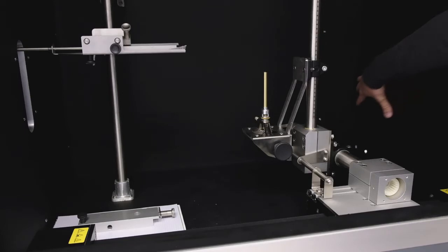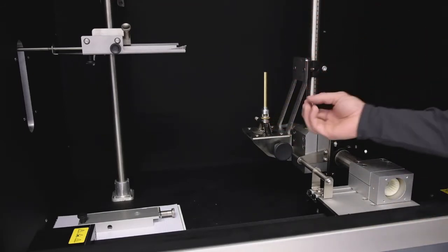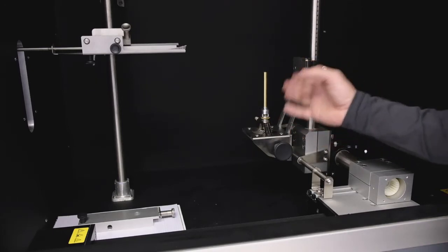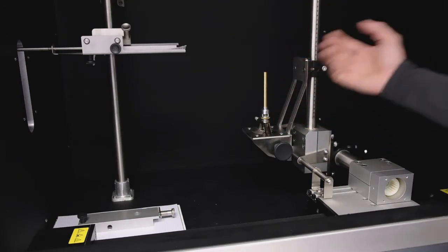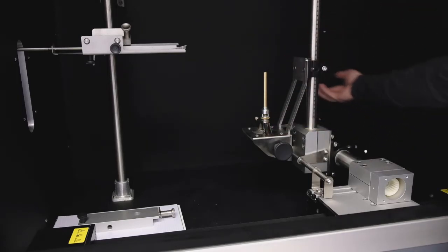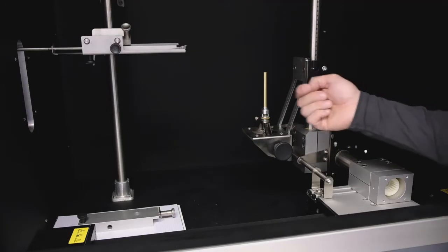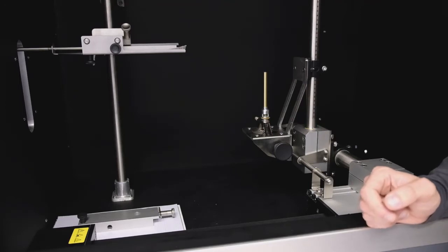Behind this wall we have all the electronics, all the connections to the thermocouple, and of course also for the gases. For the burner itself, there is also the possibility to have some safety guard. There will also be a thermocouple which detects the temperature of the burner. So if you start your burner and burnable gas comes into the burner and it is not ignited, the software can see there is no flame anymore, and it will shut down the valve and also the mass flow controller itself.